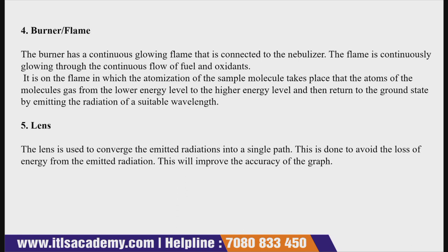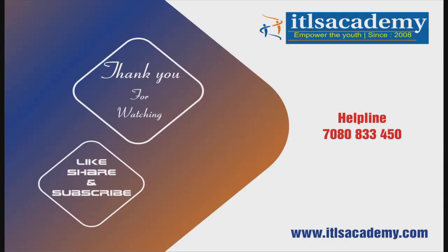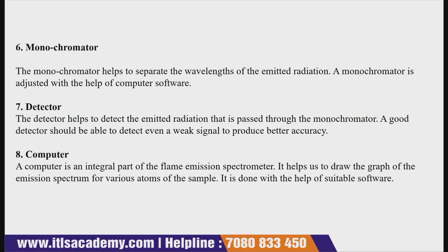What is the logic behind that? You must know that the fuel and oxidant act as a carrier, or a good source, for the smooth flow of the flame. So these are certain questions that can be asked in the interview.